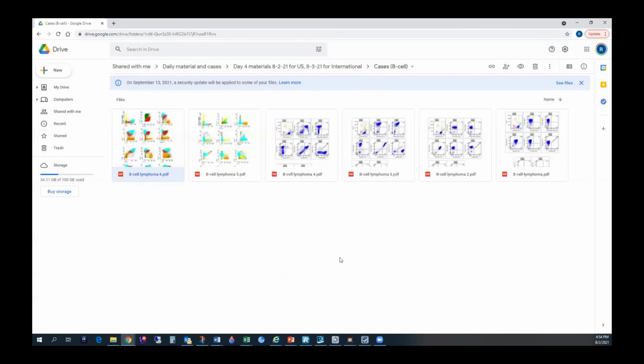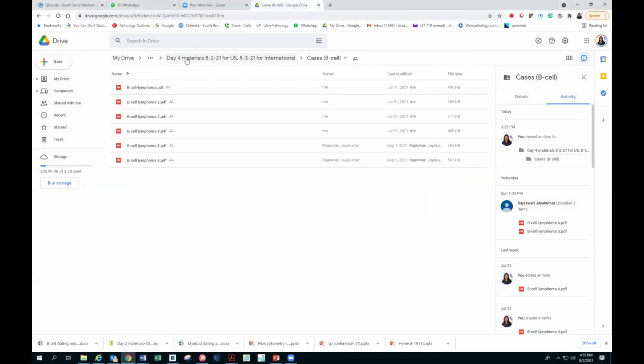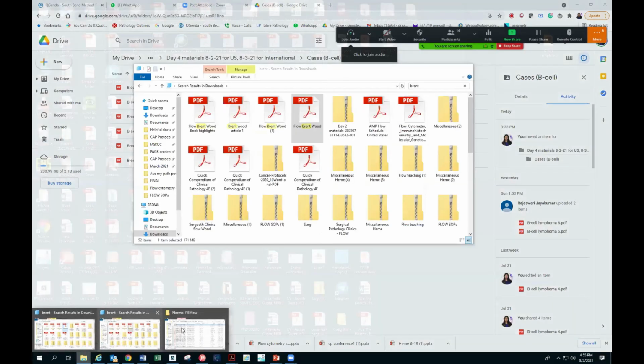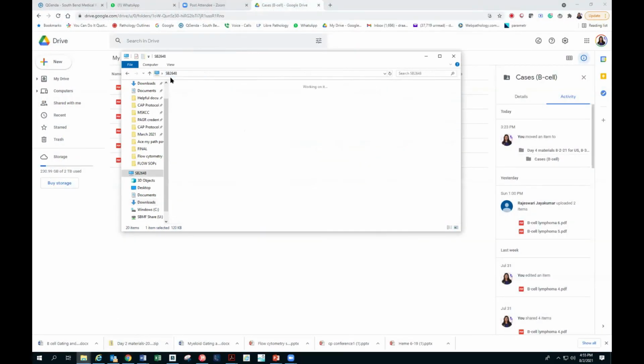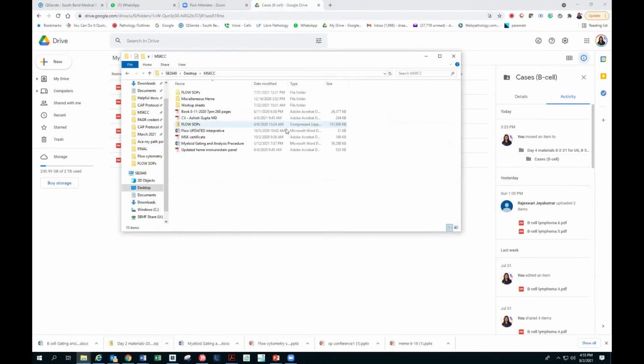Okay. I'm going to stop sharing, and I'm going to find something. In the meantime, Akansha might talk something. I want to find something. I can try to find my flow that I was going to show. Let's see. It should be somewhere. I want to reshare after I find a case. Okay. So desktop, I think I have it somewhere here. Yes.